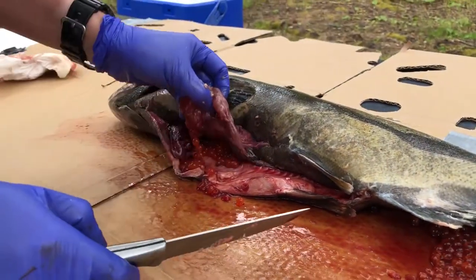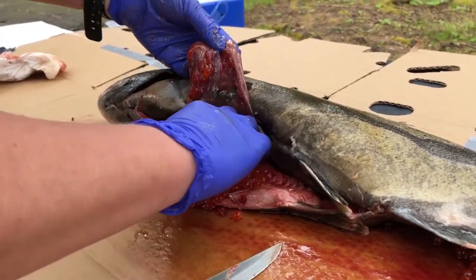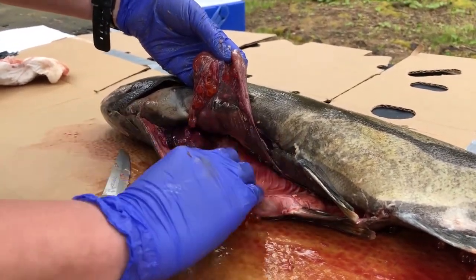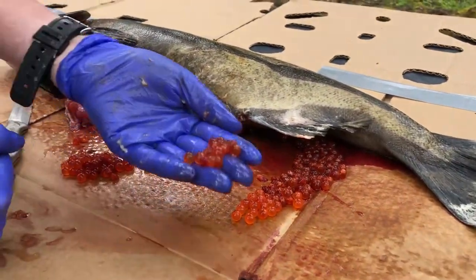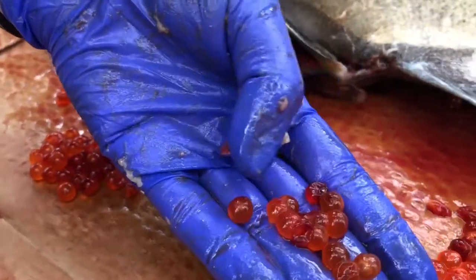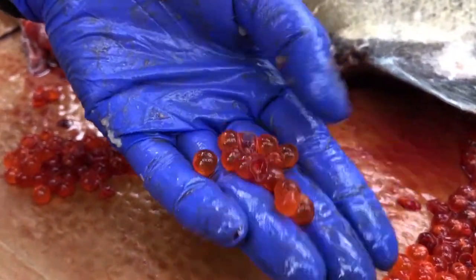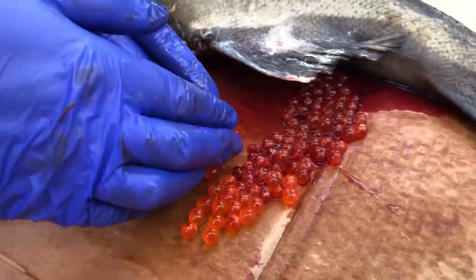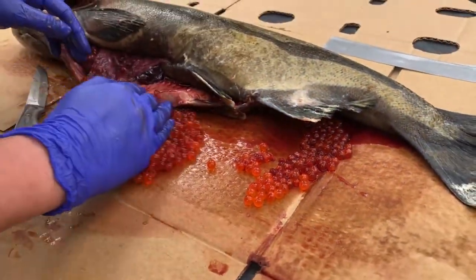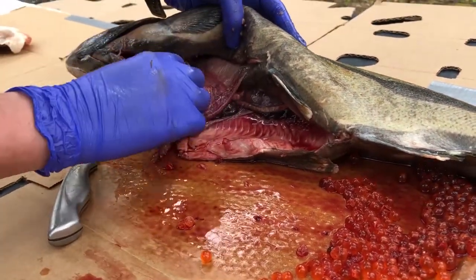I'm going to cut these out of here — there are lots of eggs in here. You can see what these eggs look like. A female fish will typically lay 2,000 to 5,000 eggs in one spawning, so each of these egg sacks would have held about 1,000 eggs or more.